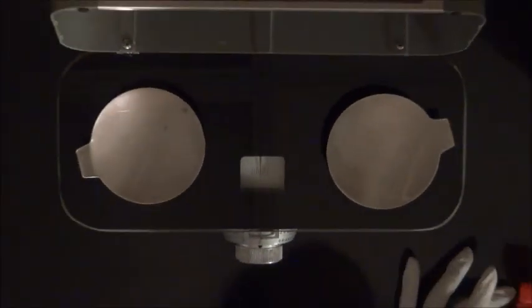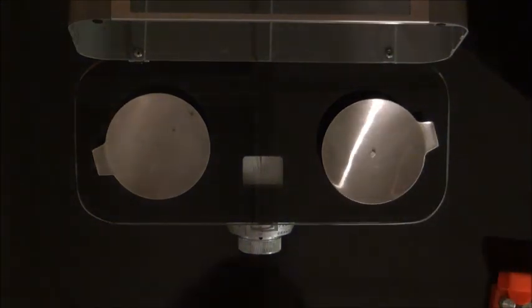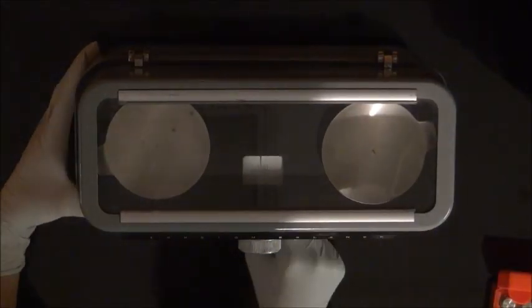Place the 10 mg weight on one of the empty pans. Close the lid and un-arrest the balance. Stand directly over the balance and observe the needle at its new rest point through the top of the glass. Record the number of divisions the weight shifted the needle from zero in the table. Estimate to the closest 0.1 units. Repeat these steps, increasing the weight on the pan by increments of 10 mg up to 40 mg.